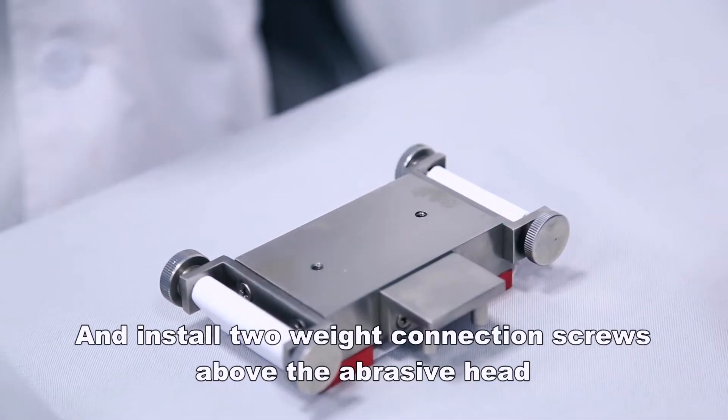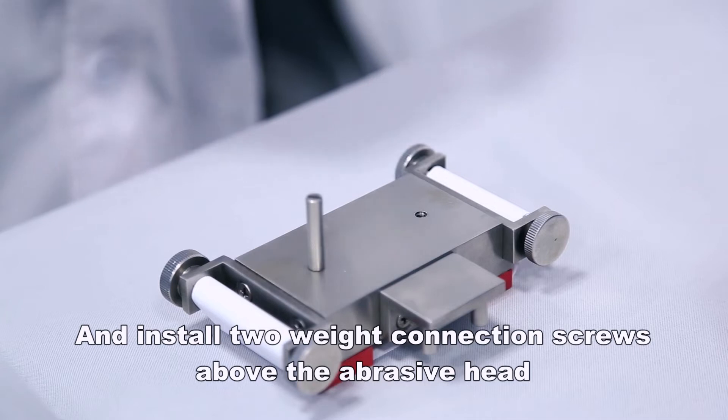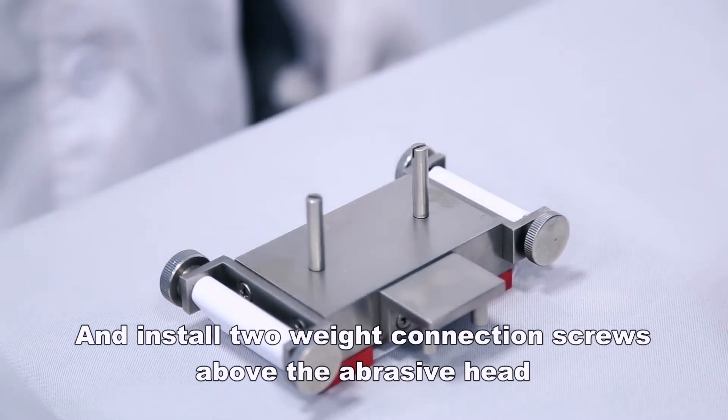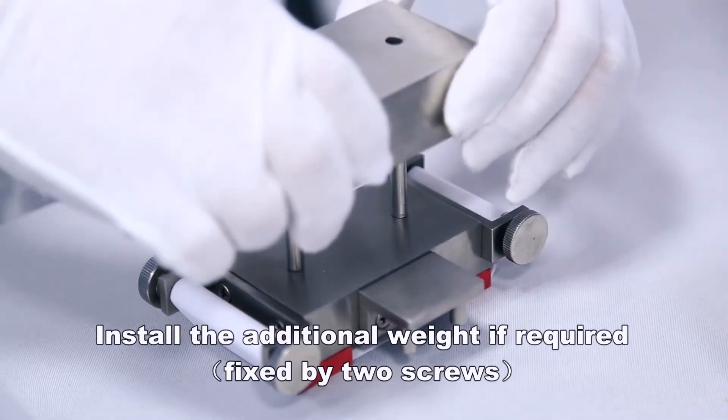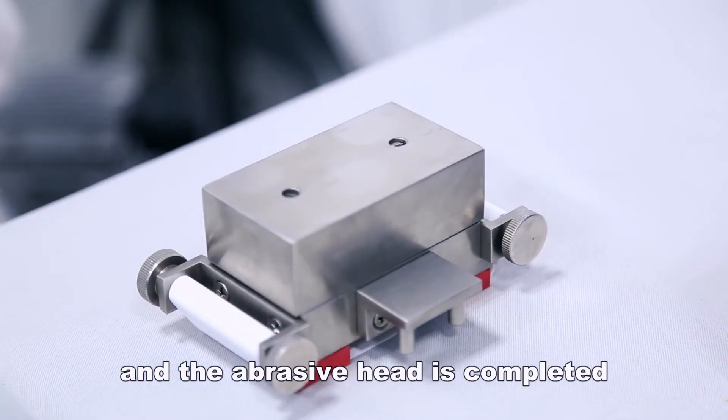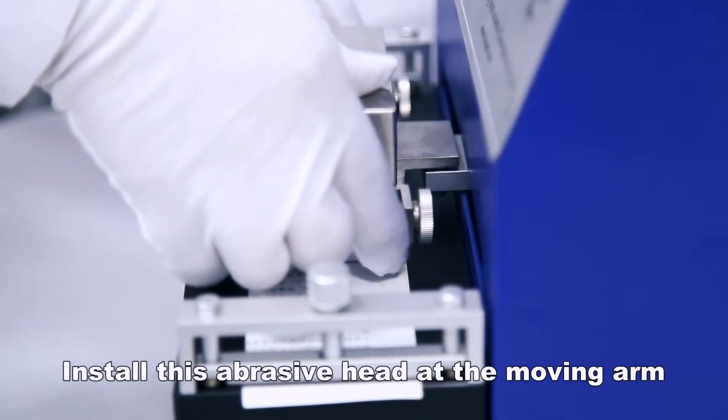Install two weight connection screws above the abrasive head. Install the additional weight if required, fixed by two screws, and the abrasive head is completed. Install this abrasive head at the moving arm.